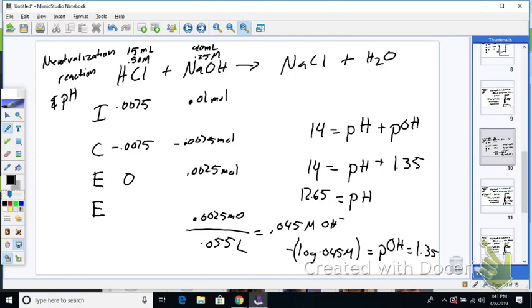What is everybody else doing? You might have to tilt it so that it's in the solution. Matthew's just reading 0.97. Mine's at 1.2. Mathematically, it should read 0.6. We're double that. We're at like 1.2. 0.87. Okay, so what we'll do is just go with what it's reading.